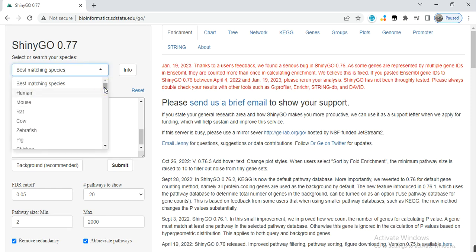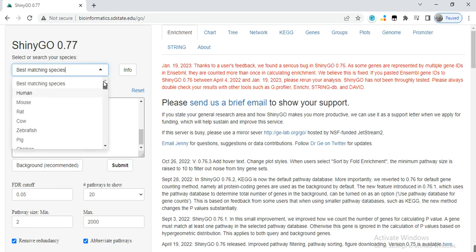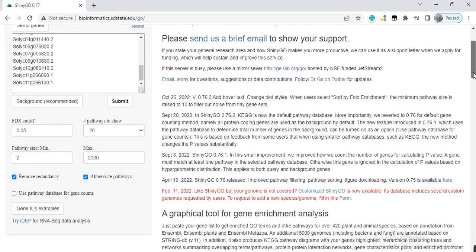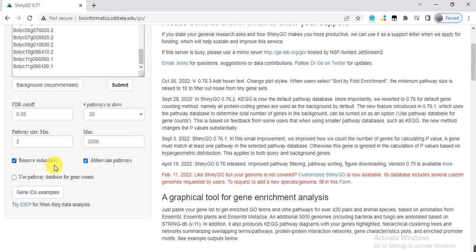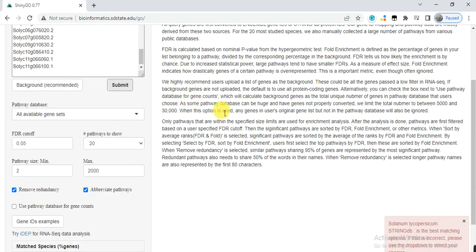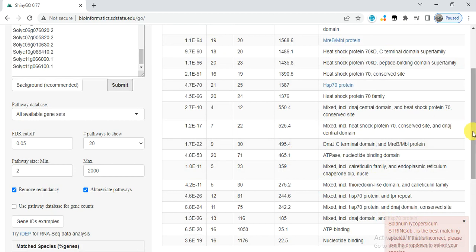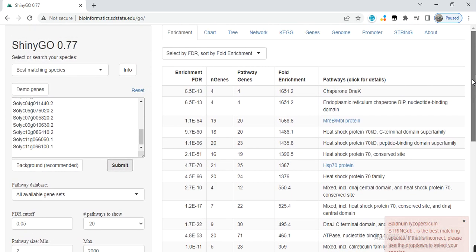Keep the other default parameters as they are, and then click on submit. It will do the process, and here it says Solanum lycopersicum. So it identified the species by itself.